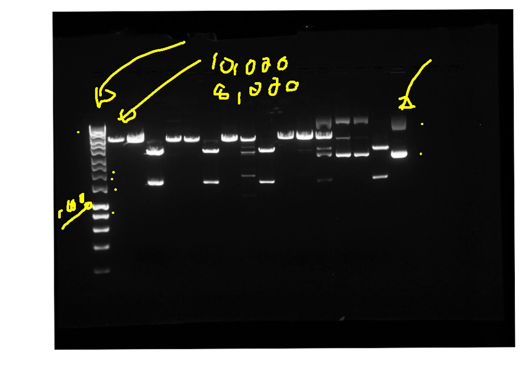Now DNA when it comes out of E. coli and it's extracted is in what's called a supercoiled form, and supercoiled plasmid DNA is a bit like having a rubber band you wind it up and wind it up and it becomes a rather small tight ball.